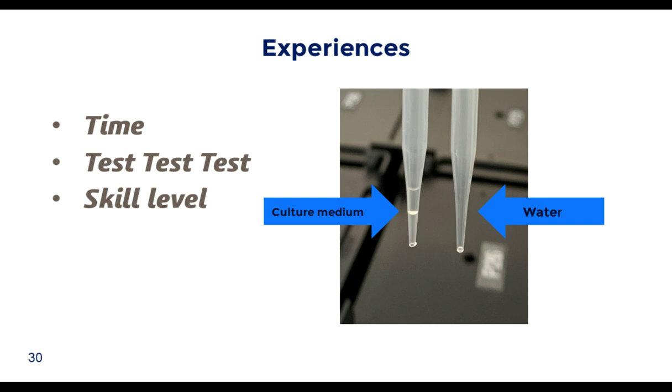Then you may run tests with culture with a representative cell density. Later you may realize that the medium pipettes differently after a number of days of incubation than it did in the test plates. After testing with single or small numbers of plates, your method may not behave as you would like after representative numbers of plates are included, with robotic actions performed in the interest of efficiency, but not in the interest of your cells.